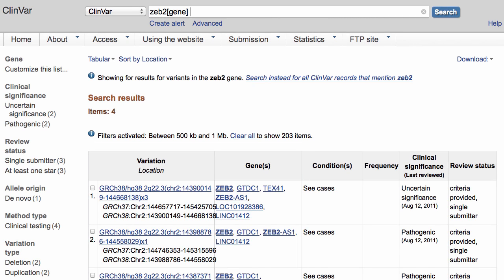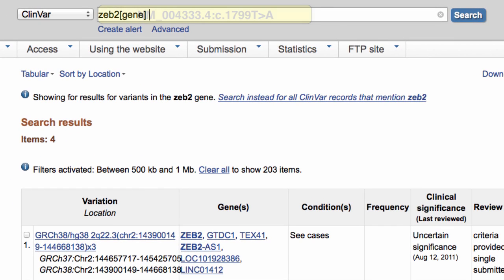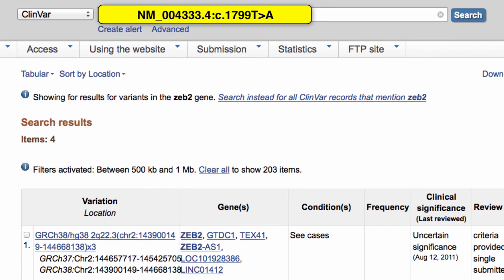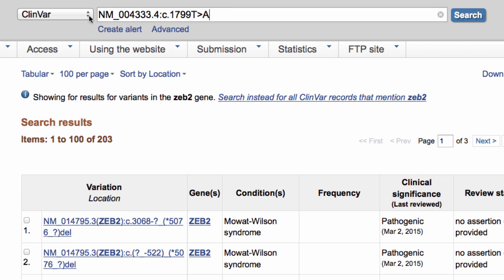A second scenario is that you have a specific variant that you are researching. There are several ways to search for a variant description, but a full HGVS expression with an accession dot version number is the most specific. For example, this change from T to A at position 1799 on this RefSeq mRNA version 4. I first need to clear my filter, then I'll run that search by hitting the Enter key.